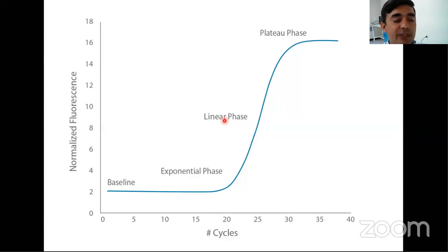It tells us that during each cycle of the amplification, the probe is breaking down and fluorescence is released. This fluorescence signal is read by the optical system of the machine, and once it reads it, the data is recorded and appears on the screen.